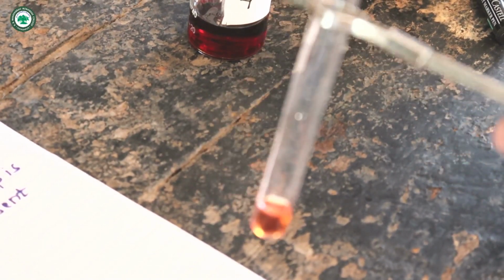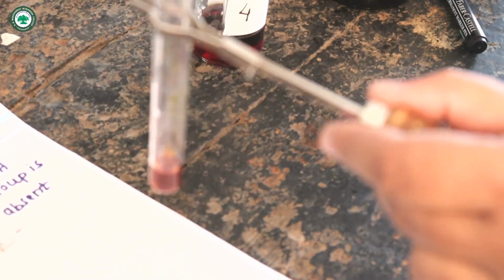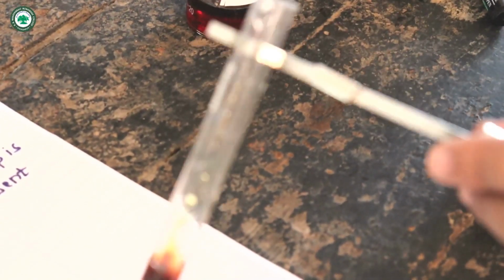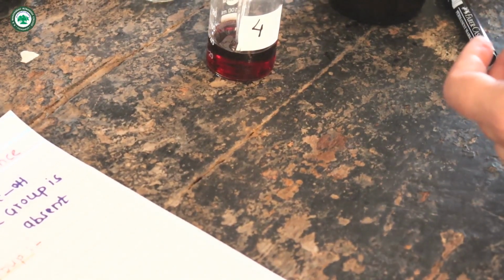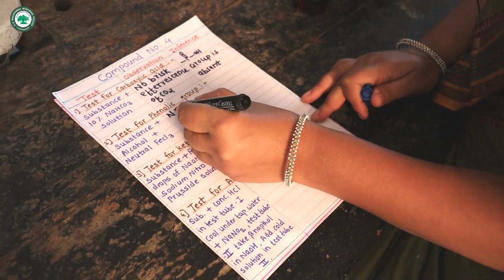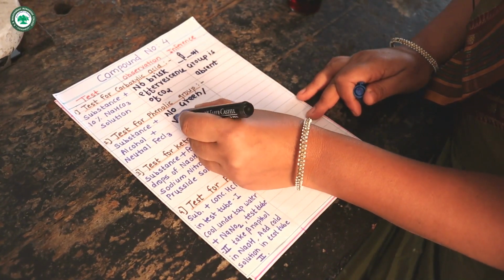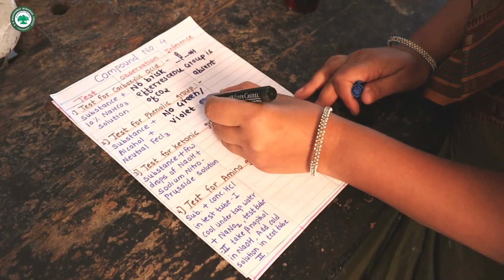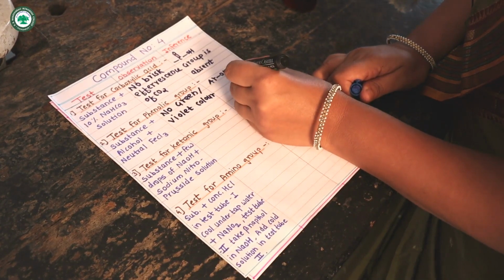If there is green, violet or blue color, phenolic group is present; in the absence of blue, green or violet color, phenolic group is absent. No green or violet color, phenolic group is absent.